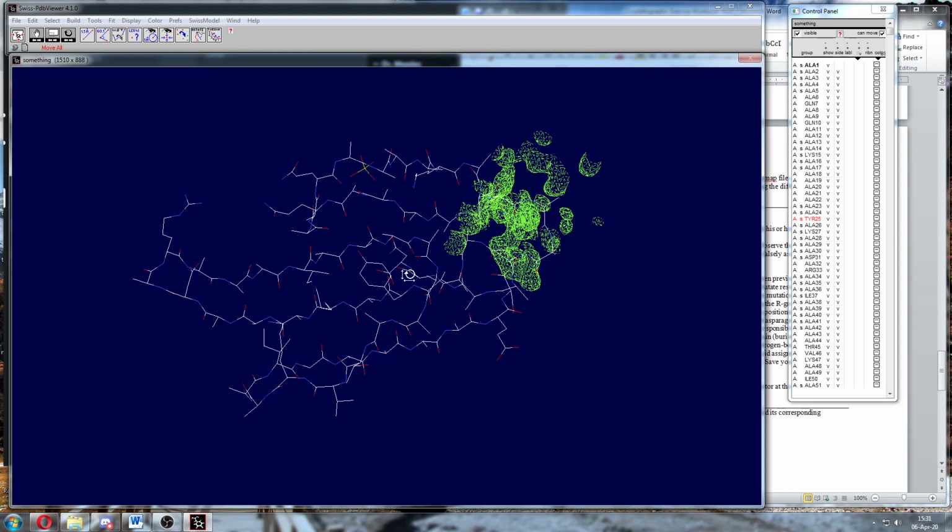And you can also send this file to each other, and you go, hey, I think number 27 or number 28 is serine. I don't know what it is. And you send it to one of your friends or classmates, and they go, no, I think it's threonine. You missed the methyl group on it. Oh, I see what you're talking about. So that's the conversation I want to happen.